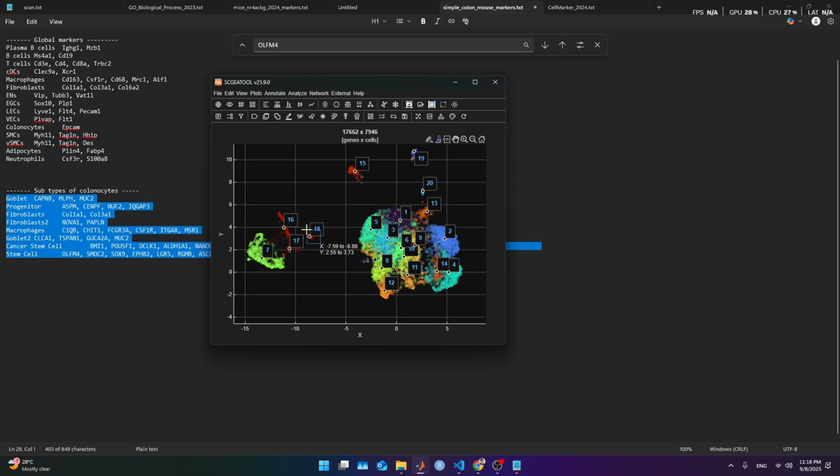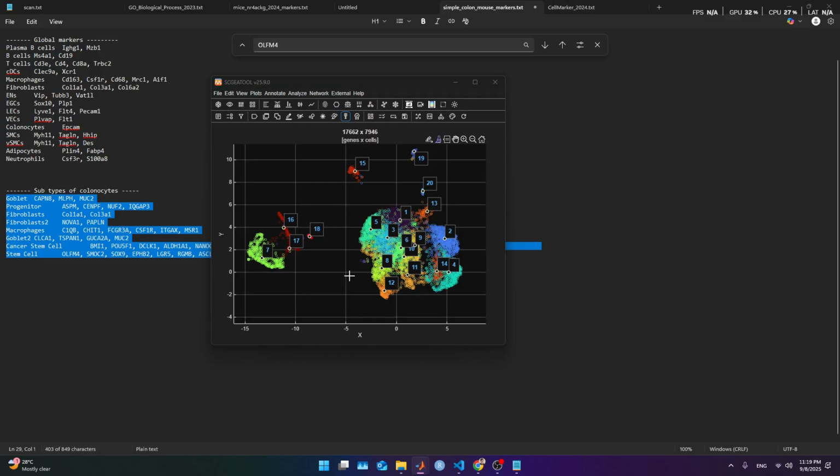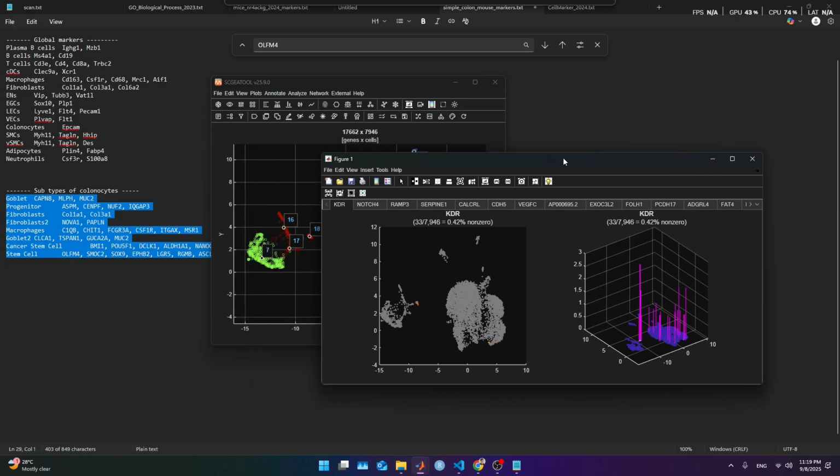And then we gotta do the 18th brush lasso brush cells. Top 20. Then we get this.